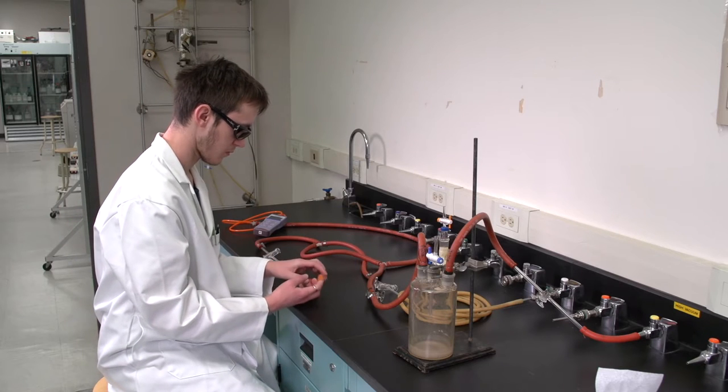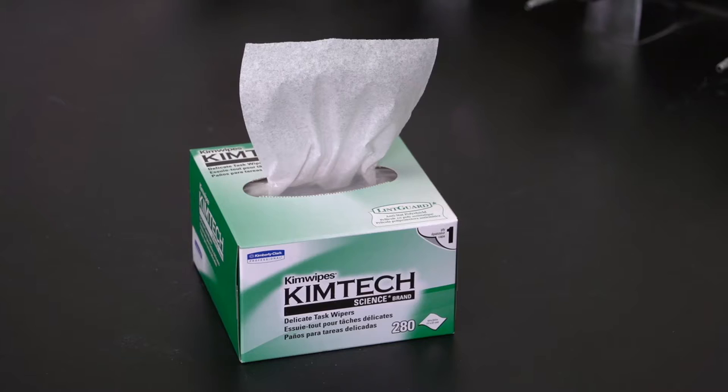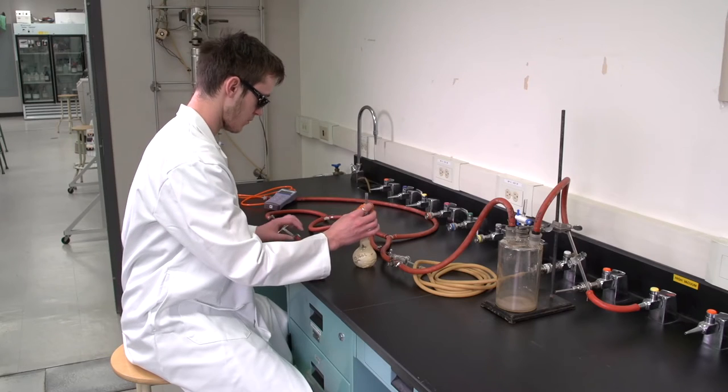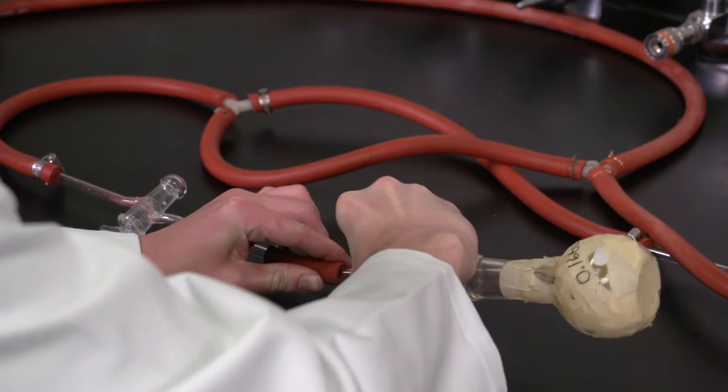To prevent the transfer of grease and moisture to the sample bottle, you will need to use finger cots or a lint-free tissue. Attach the sample bottle to the system, being careful to handle it by the stopcock.